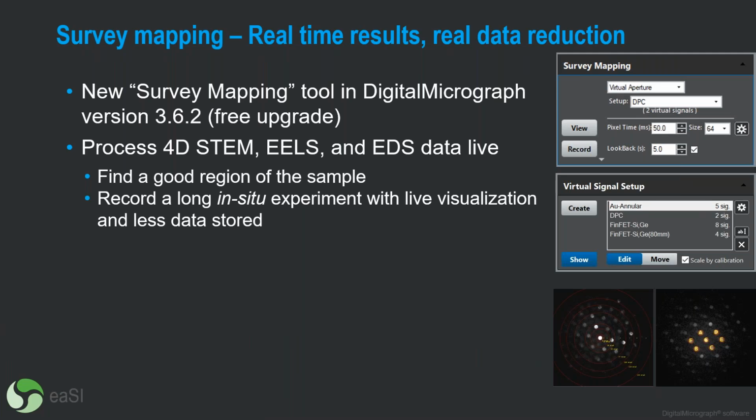One is to just find a good region of the sample, using this as a live view for spectrum imaging. Or another approach that I'm focusing more on today is to record a long in-situ experiment with live visualization and less data that you need to store.